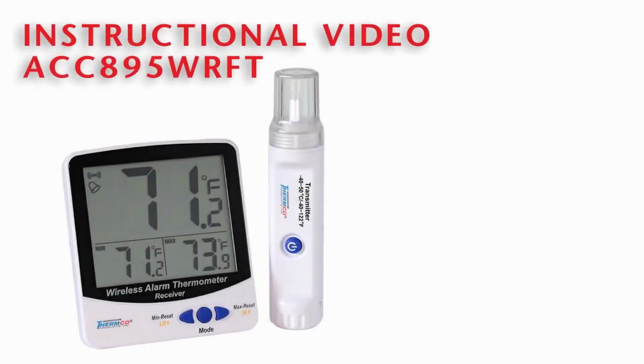Welcome to Thermco Products. This instructional video is for the ACC895WRFT, a wireless big-digit digital thermometer.